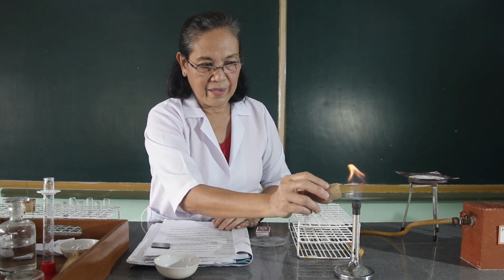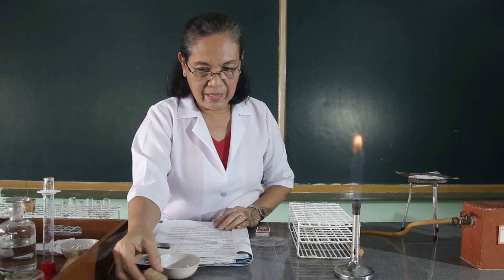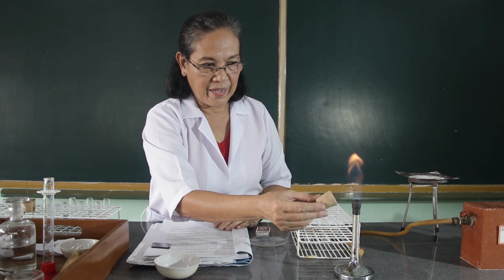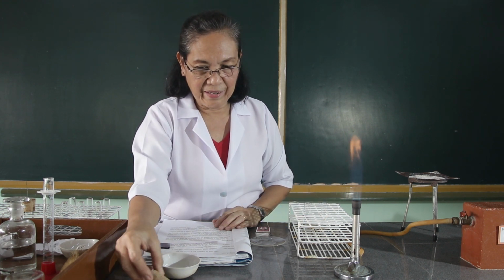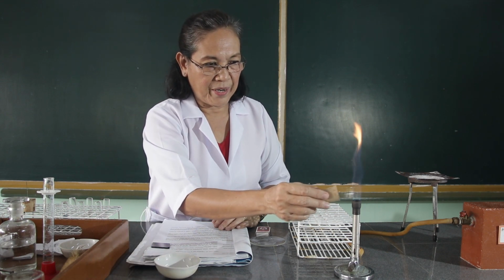A little. There is still the color imparted by the potassium. Let's clean it again. Okay, no more. Okay, so there is still a little. Okay, I think no more.